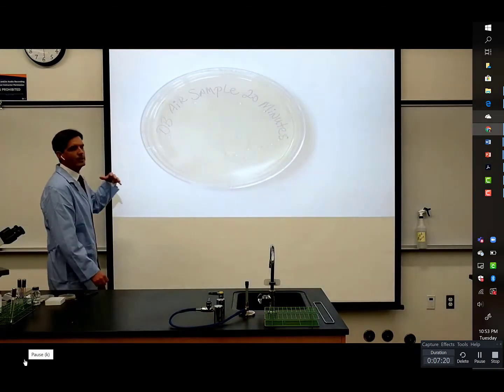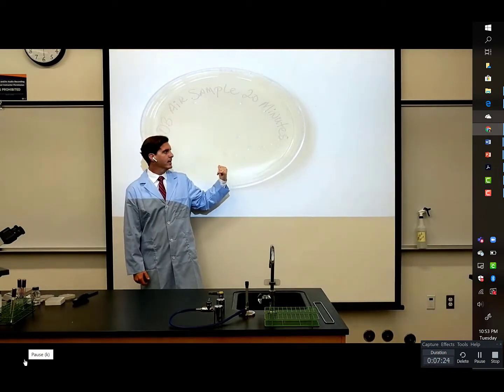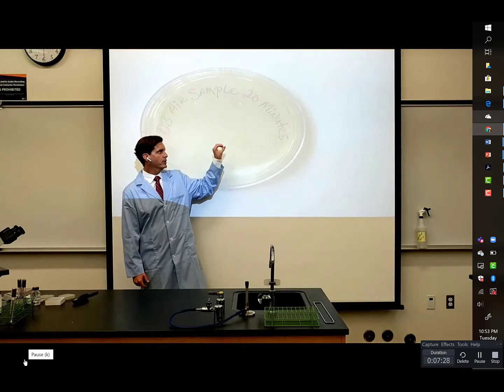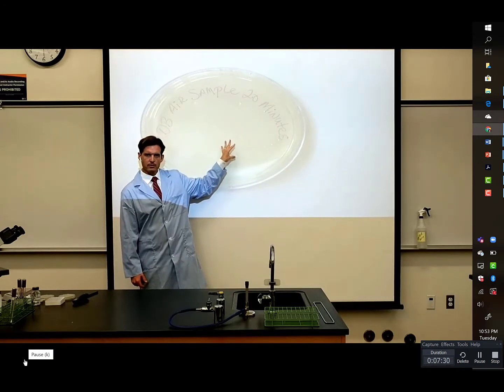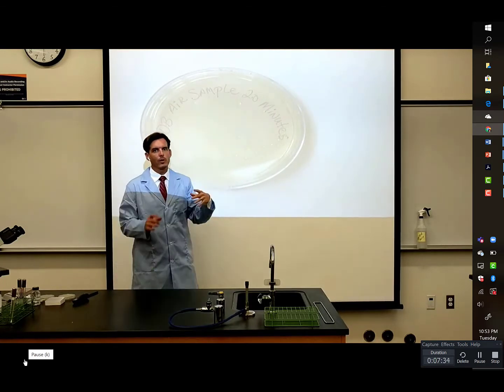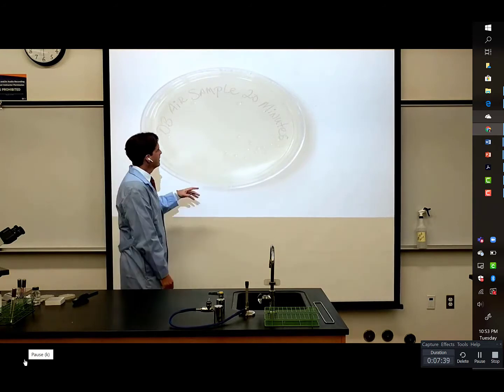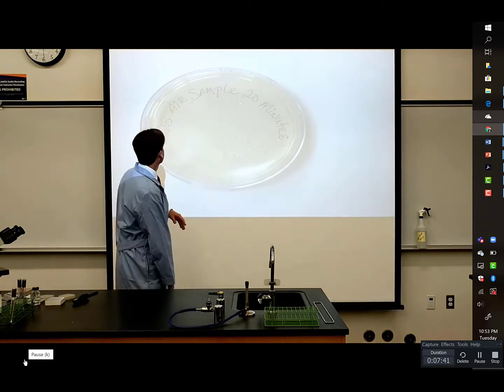And if you're wondering how it is that flipping the plate over makes a difference, it has to do with the fact that the moisture source is now on the top. It still has moisture, but the way that the moisture will escape and not build up is that if you look really closely, it's actually a little hard to see.